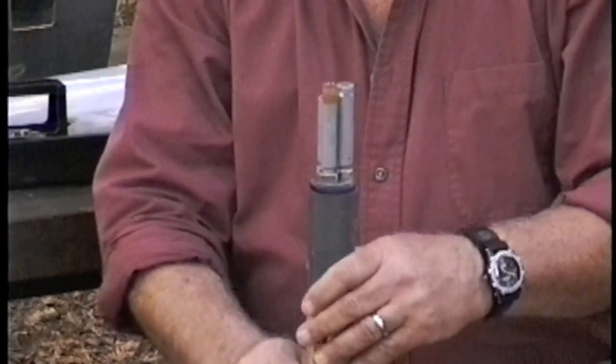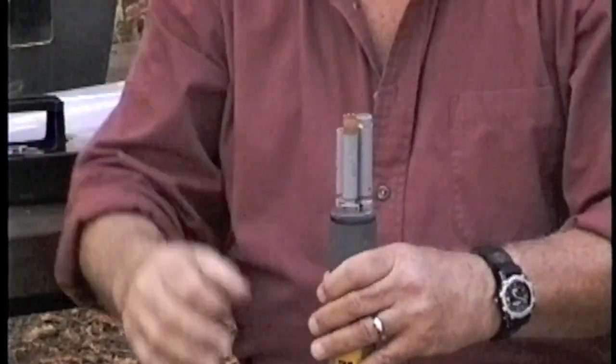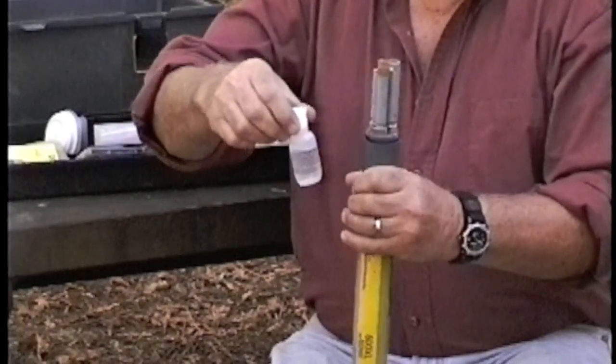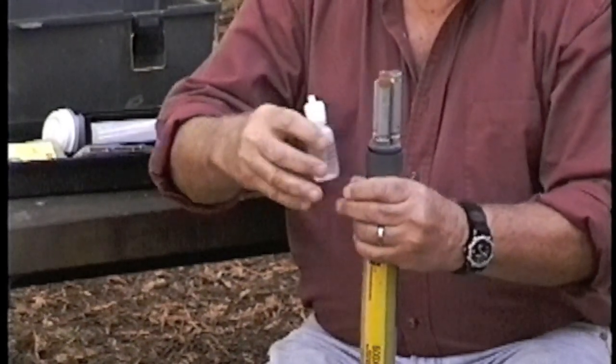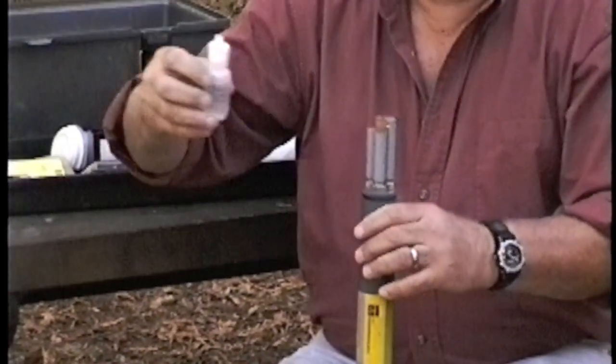The dissolved oxygen membrane will be installed on top of that and secured with an O-ring. The first thing we need to do is prepare the electrolyte, which comes dry and we simply add deionized water, mix it, and we have the electrolyte.